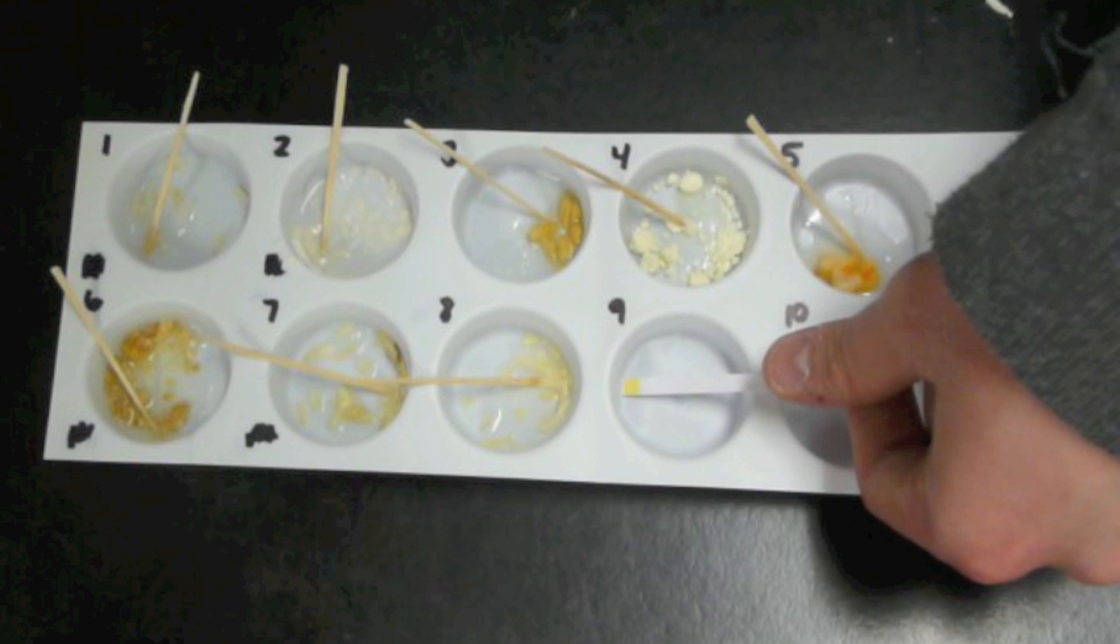We add this test strip as a control. We can look back at the end of the experiment and compare the yellow box on this test strip to all of the yellow boxes of each test result.